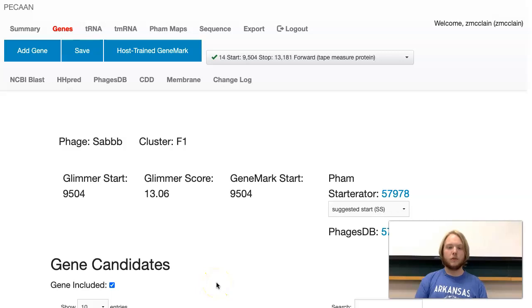Hello, and welcome to the video about GeneMark. This video will teach you how to use GeneMark, what everything in GeneMark means, and why it's important.